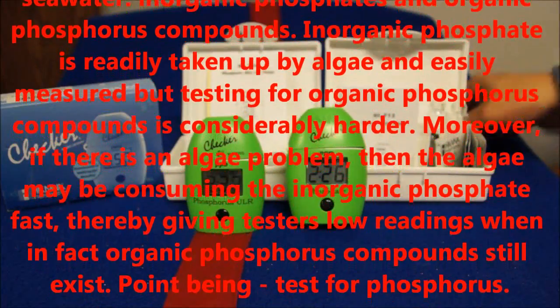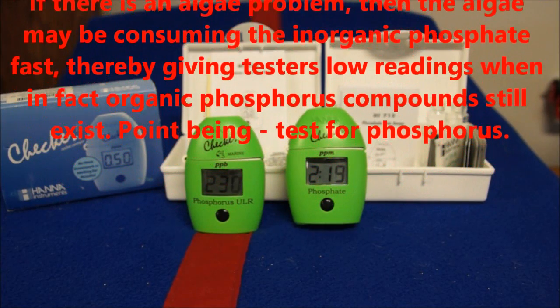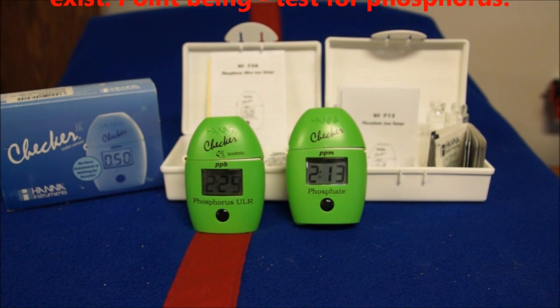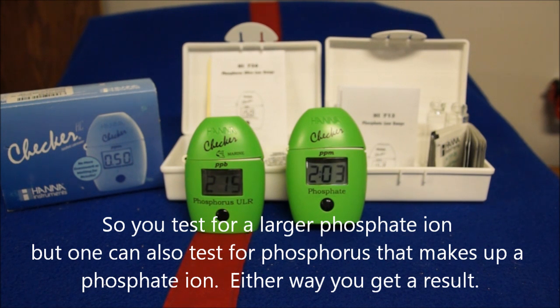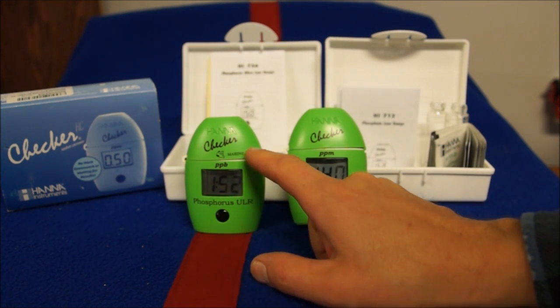If you're picking up phosphate but not detecting all the phosphorus, it might lead you to think at the beginning that your tank is fine. But remember, phosphorus in the water column will attach to oxygen and become phosphate. Sometimes your phosphate reads low on the Hanna checker because the algae is consuming it — so you look at the checker and think you have no phosphates, but the algae is still growing like crazy. When you run the phosphorus ultra low checker, you'll find there's more phosphorus in the tank than you expected.